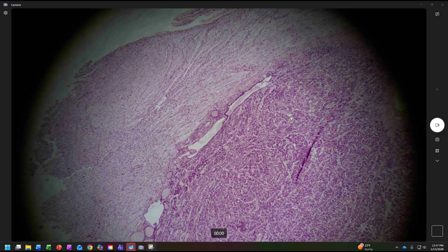But again, what do we see? We see this large, dark, grainy area, and this large, but maybe a little less prominent, lighter, wispier area. Okay, and we can see some other things. This little gap between the two regions isn't as pronounced as it was before. It looks like these are some blood vessels. That looks like red blood cells in there. These are probably some blood vessels here. Not quite sure what that is, but again, we're not worried about that.